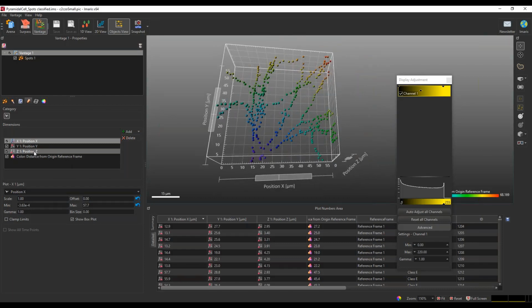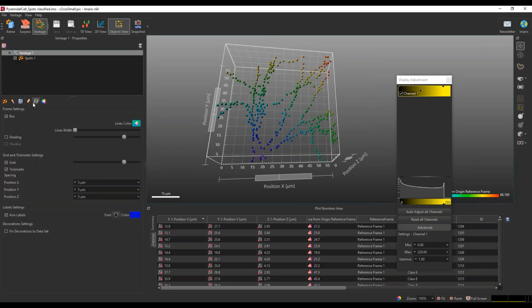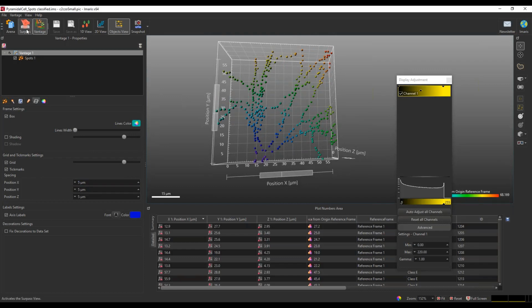So taking a few minutes and figuring out the things that matter most to you is important. Daniel's gone through and given you a highlight of those, but if you're interested in making this perfect for yourself, I recommend that you take some time to play around with it and see what it looks like with your own data, because that matters the most, right?